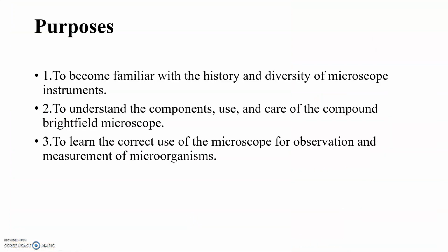Now the purpose of microscopy: it is to become familiar with the history and also the diversity of microscope instruments, and to understand the different components of the microscope, how to use the microscope and how to care for the microscope. The third purpose is to learn the correct use of the microscope for observation and measurement of organisms. So these are the main purposes of microscopy.